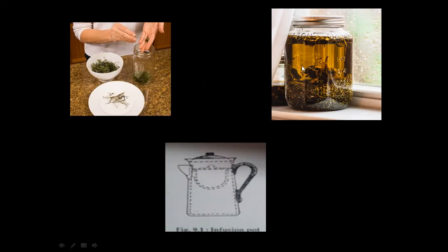When you pour the menstruum, which may be different depending on the raw material, it enters into the raw material, and within the cell it takes place, that is called endoosmosis.